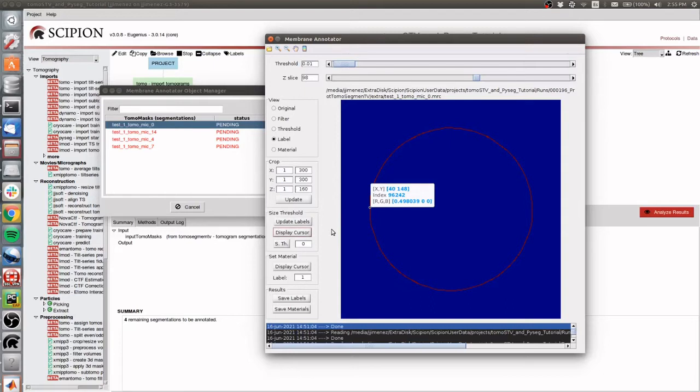Another thing that I can do, if I have a very dirty representation with a lot of undesired structures, is, once I know the size of this one, or by clicking on them in the label view to see the size of each, you can introduce the size of the objects you want to be displayed, and the rest of them will be removed.